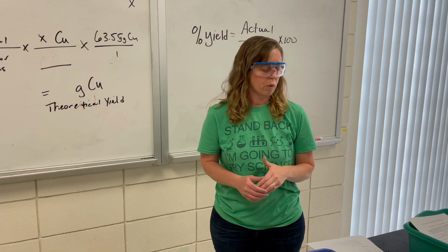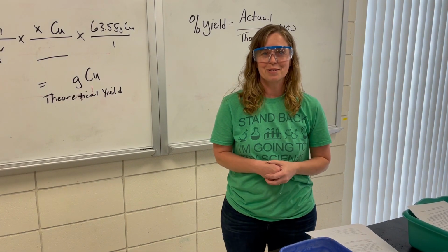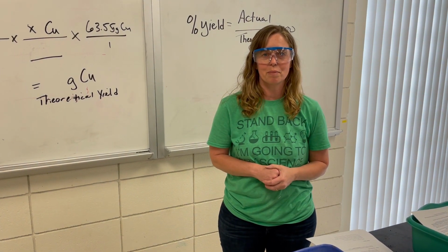In a minute, once the reaction takes place, we're going to start back with part 2, where we're going to show you what's happening in the reaction. So we'll start back in part 2 here in a minute.